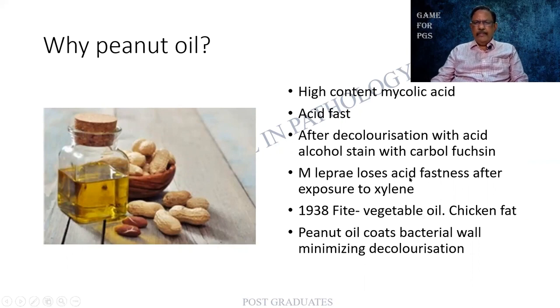If it were to be by xylene alone, you find Mycobacterium leprae will be losing its acid fastness after the exposure. In 1938, Fite was a person who developed the vegetable oil and the chicken fat for the deparaffinizing. Later, this has been replaced by the peanut oil, which coats the bacterial wall, minimizing the decolorization.